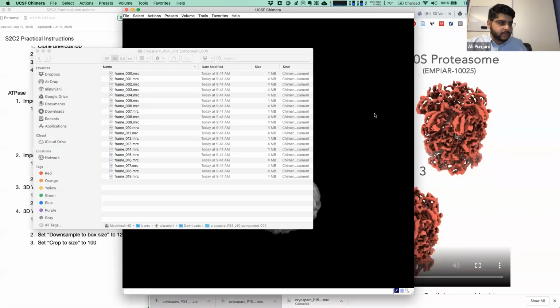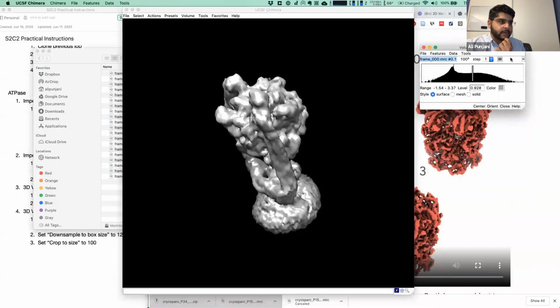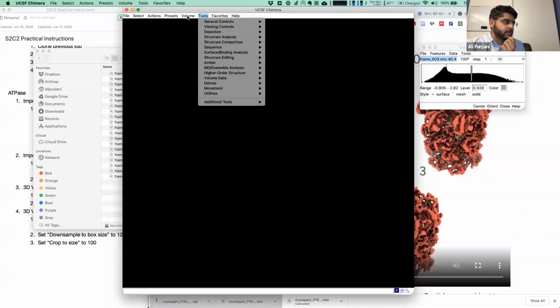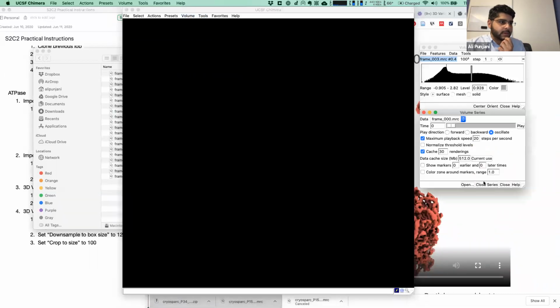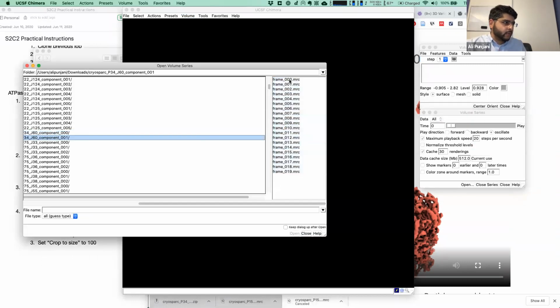So what I can do is close this first volume series, and then open the next series, which is component 1.